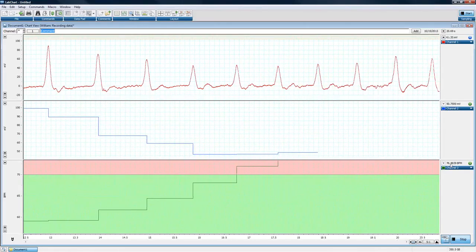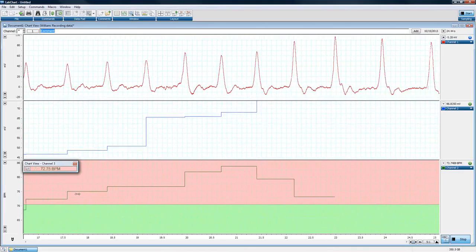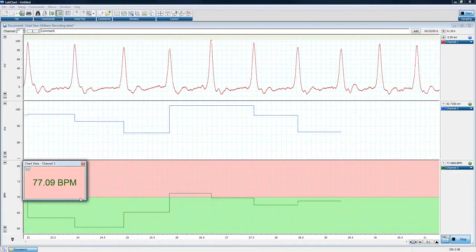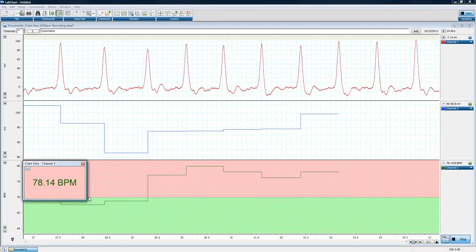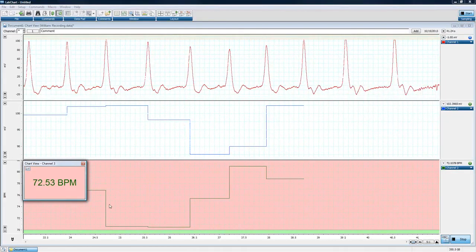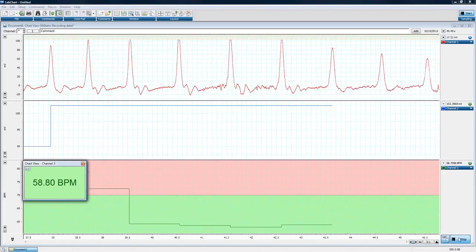Another great indicator is to use the DVM color to indicate where we are. You can see the DVM here is turning red or green depending on where my data is. That's a nice feature of the guidelines, that it changes colors while I'm recording data.